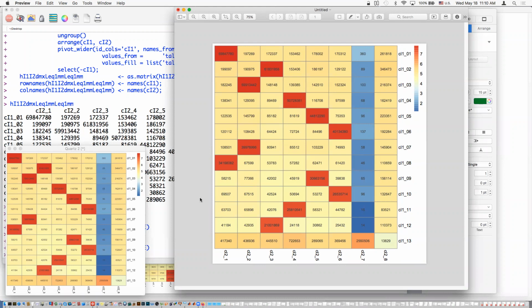So there's different mechanisms for this, but I don't think we really have time to get into the mechanisms. You can read literature and online discussions on how this can happen in various ways. But basically, there's two points in time where it can happen. During library prep, where samples are being handled in batches and so on.